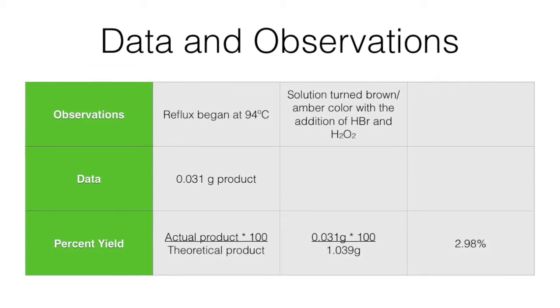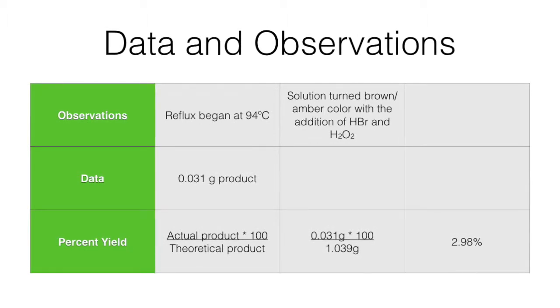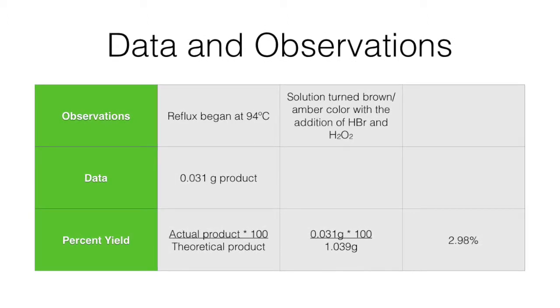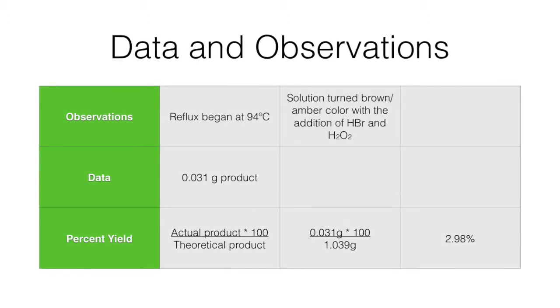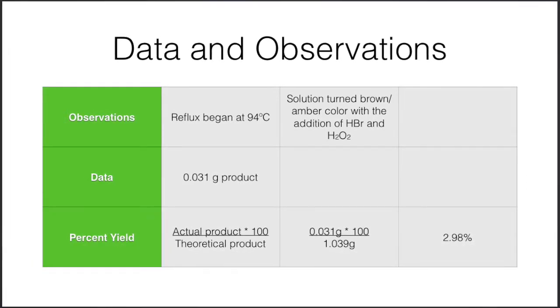Figure 2 displays the proton NMR of the obtained product. Present are 3 peaks, a doublet and 2 singlets. The 2 singlets on the outskirts of the NMR are the solvent, deuterated chloroform, with chemical shifts of negative 0.006 and 7.258. Figure 3 displays an enhanced view of the middle peak, the doublet present, which has a chemical shift of 1.551.